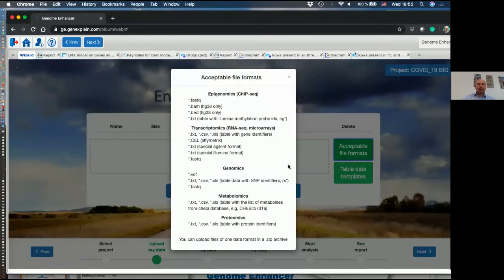file formats. And the power of the tool is that it's multi-omics. The example today, which I showed, was transcriptomics only. But in fact, this tool is able to integrate several types of omics, and you can see here those omics which this tool can work with: namely transcriptomics, epigenomics, ChIP-seq, genomics like VCF I already mentioned, so basically sequence of genome, exome sequencing for instance. Also metabolomics can be considered as input, and proteomics.